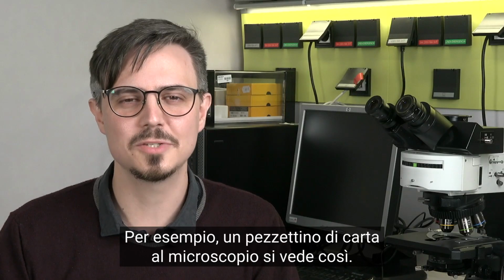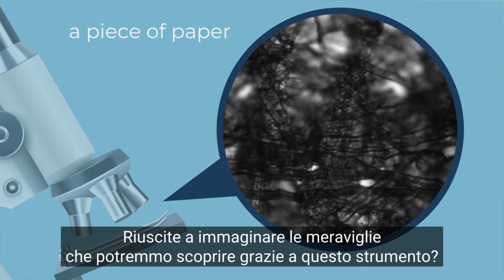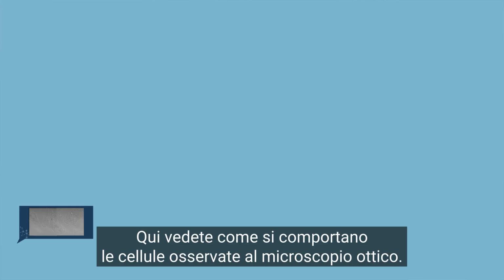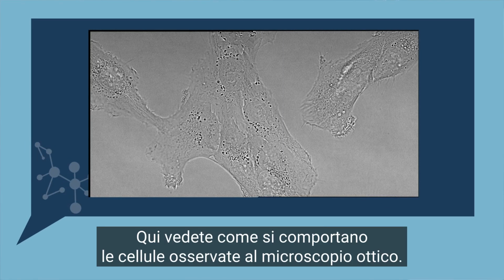For instance, this is what a tiny piece of paper looks like under the microscope. Can you imagine what a wonderful world can be found using this equipment? Here you can see how cells behave while they are being imaged under the optical microscope.